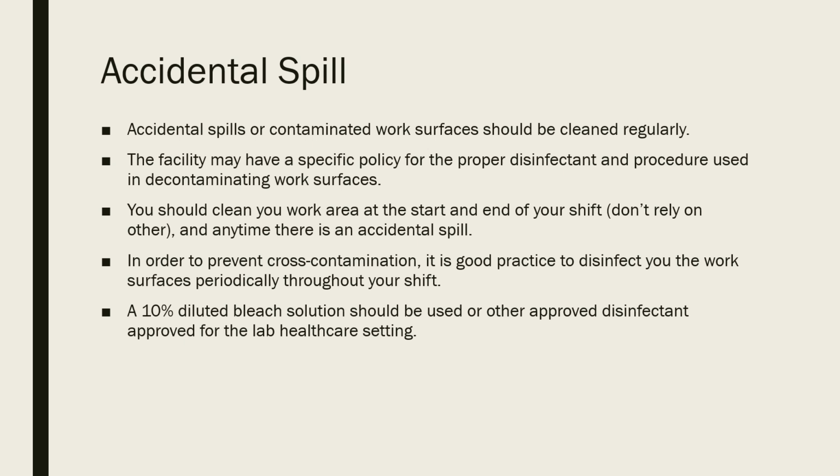The same aspect applies when you come into the student lab. Make sure you clean your workstation. While you're not supposed to eat and drink in the lab, occasionally you may take your gloves off to switch up to get a new pair of gloves, and if you lay your hand on that counter in between steps, you could potentially pick up something that you don't want. So if you do notice that you spill something while you're working, make sure you clean it up immediately. You don't want to leave something sitting on the counter that could potentially cross-contaminate your specimens or cause an infection in you or your co-workers.